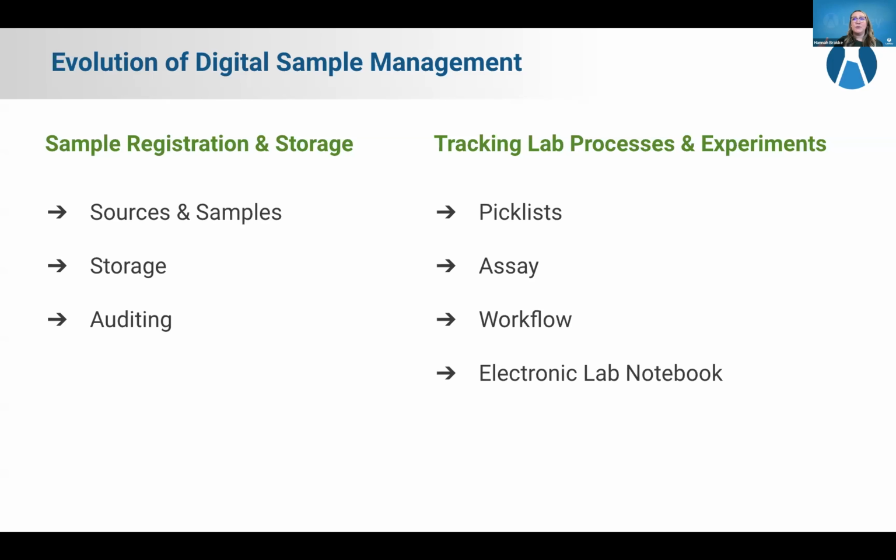But as labs progress on this digital data journey, they essentially start to think about ways that they can track other work within systems, either within the same system or different systems. We've set up Sample Manager in a way that we hope allows you to start to expand within the same system, because that data centralization piece can be really core to the efficiency of science and being able to answer questions really quickly. So we have a variety of tools to do this within Sample Manager.